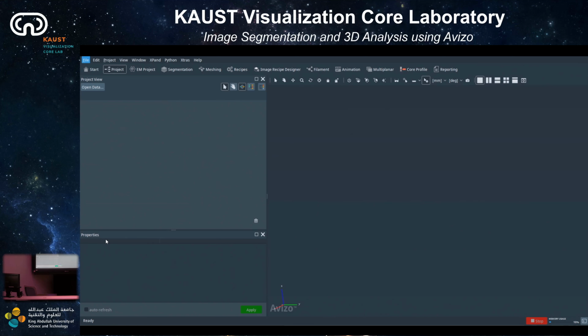If you have very small porosity and you do blurring like a median filter or box filter, you might lose it, because it averages the intensity. So it depends on the data you're looking at, especially if the porosity is important to you. That's why maybe you can use top hat directly instead of a median filter or box filter.